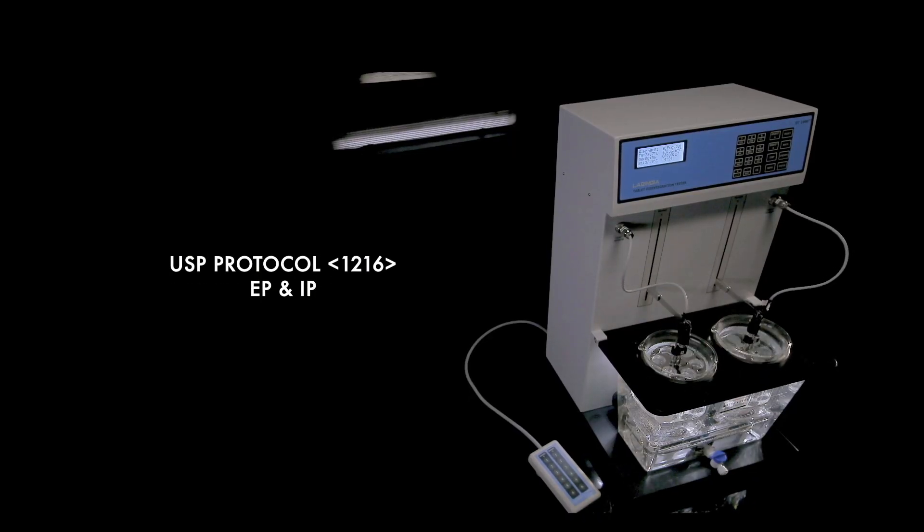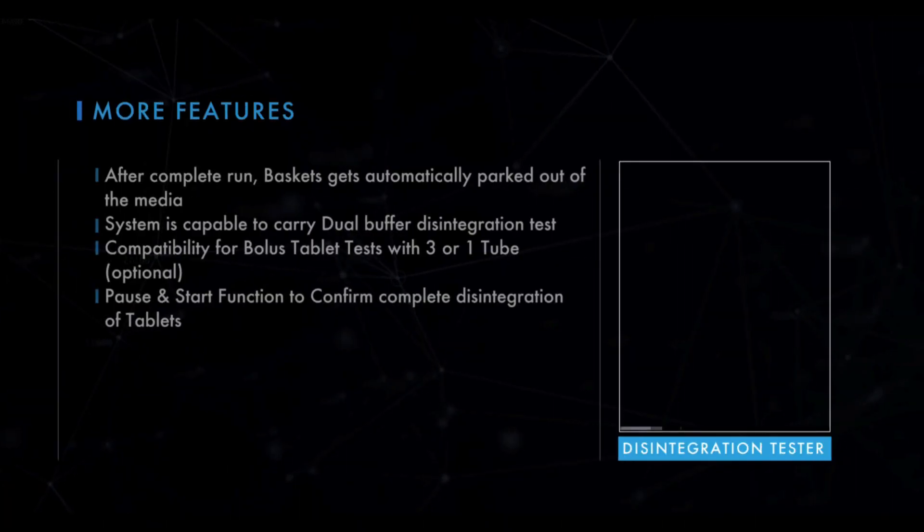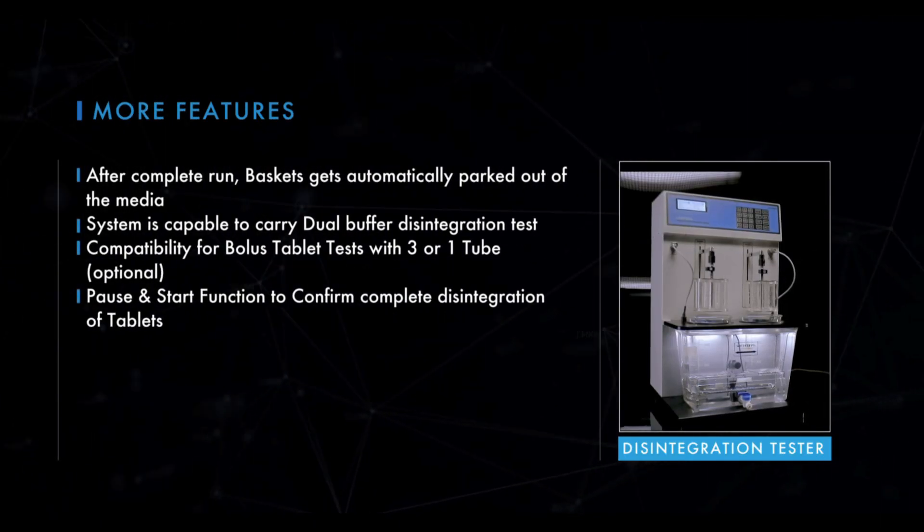Complies to USP, EP, and ASTM standards. It's our commitment that makes us one of India's leading manufacturers of analytical instruments.